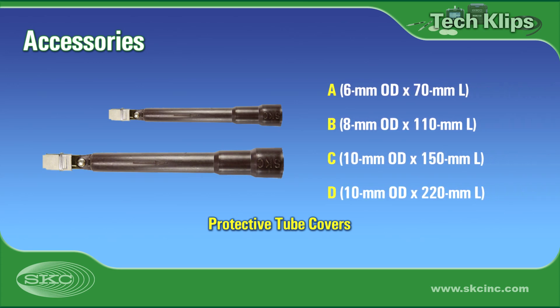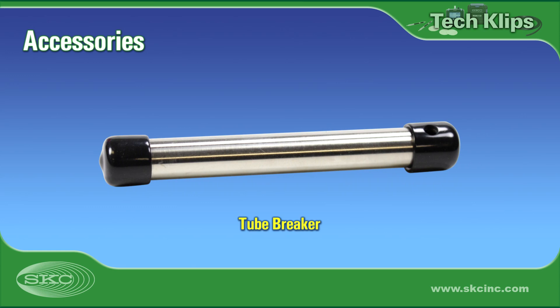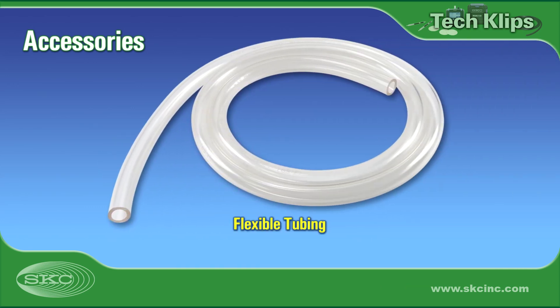Use tube covers to protect the sorbent tube during sampling and to clip media securely to a worker's clothing. Select the appropriate size cover for the sorbent tube used. A tube breaker allows you to open glass sorbent tubes cleanly and safely, and will also retain glass tips for safe disposal. Additional flexible tubing is needed to attach the tube to the calibrator and can be useful for other applications.